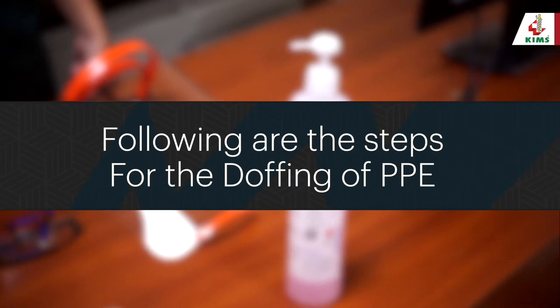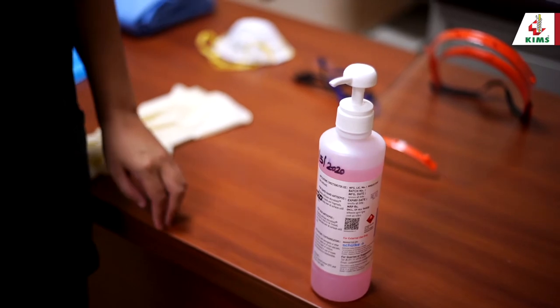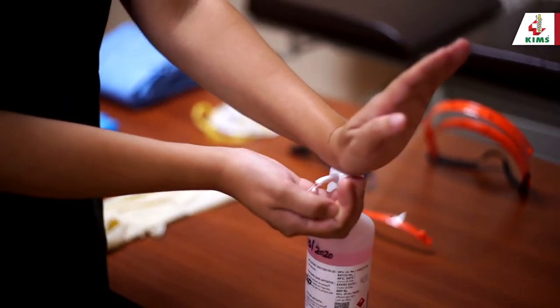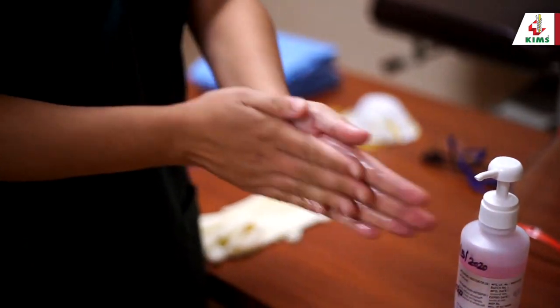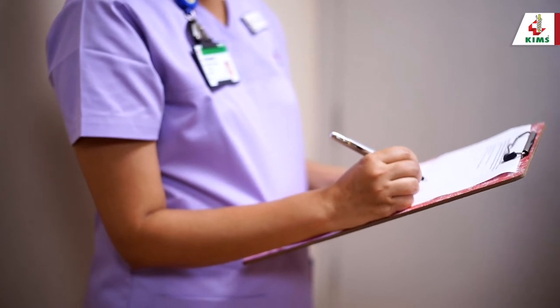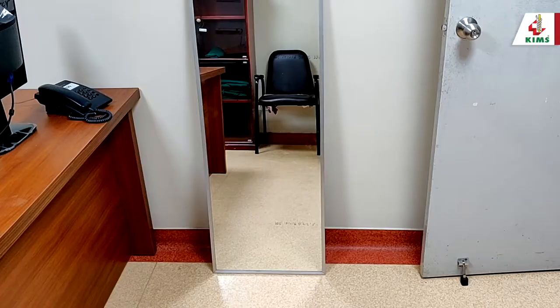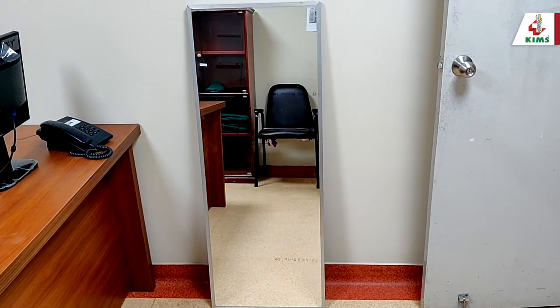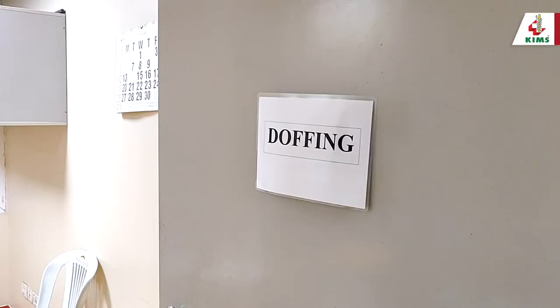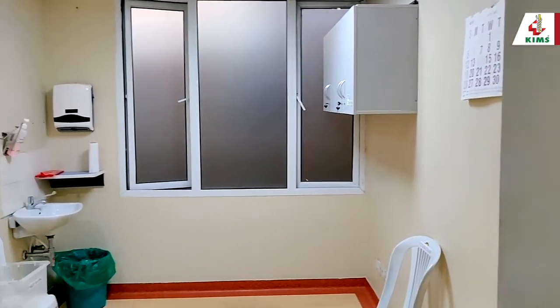Following are the steps for the doffing of PPE. Since the risk of contamination while removing PPE is high, hand hygiene must be performed after each step. This is best done with a trained observer. If an observer is present, he or she should be wearing full PPE. A mirror can be an alternative instead of a buddy. Removal should be done in an ante-room or doffing area separate from the clean area used for donning.